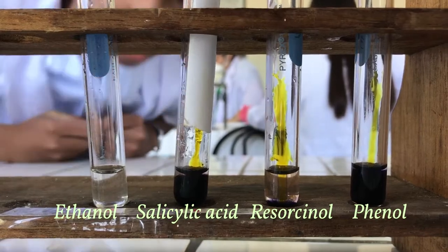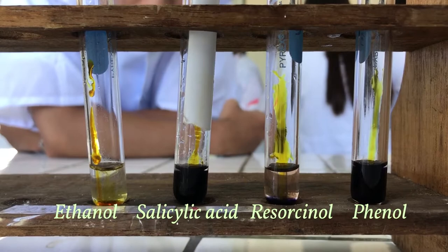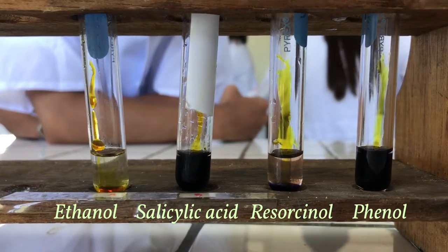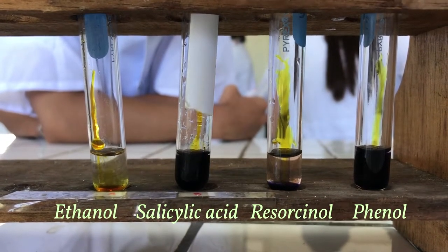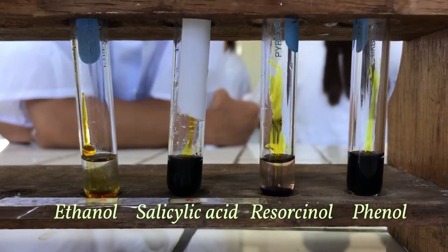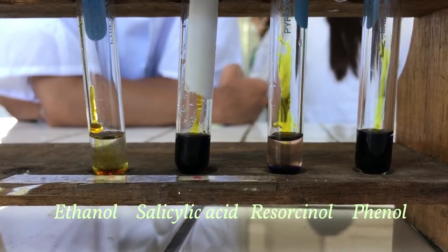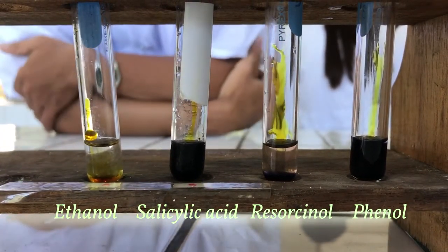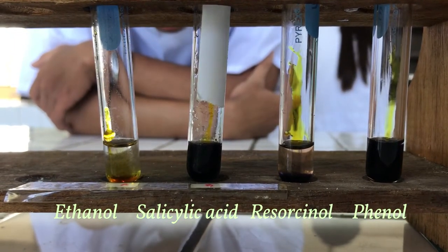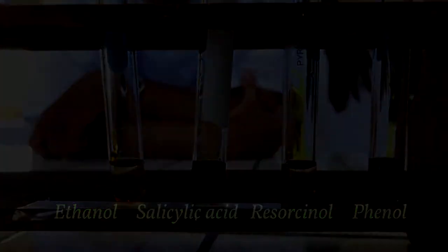When ferric chloride is added to the phenol, the solution turns purple. In resorcinol, the solution also turns purple but with two layers. In salicylic acid, the solution turns purple, and in ethanol, there is no change at all. The purple color of the solution indicates the presence of phenols. This means that the phenol and salicylic acid contain phenol.